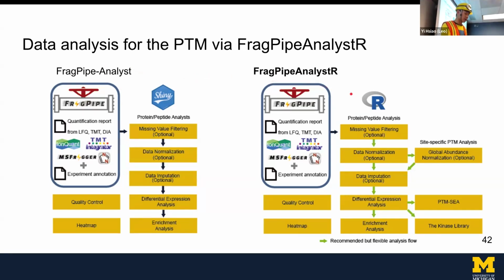It is our package. And one benefit is that if you can program, you can change some of the order of this procedure, since for different applications you might have other interests and you might apply additional filtering. So we make this plugin-like and modular, so you can switch back and forth just through programming.